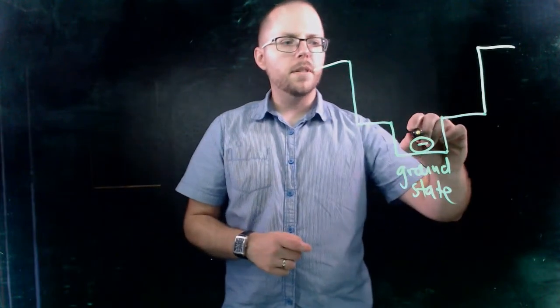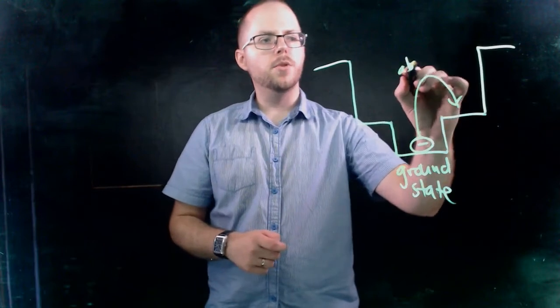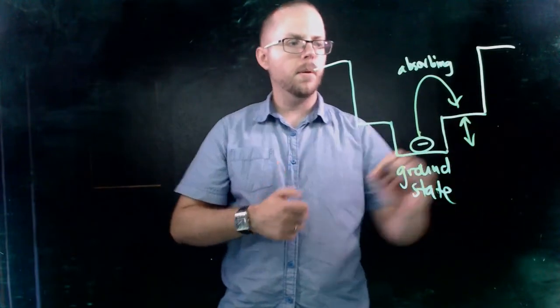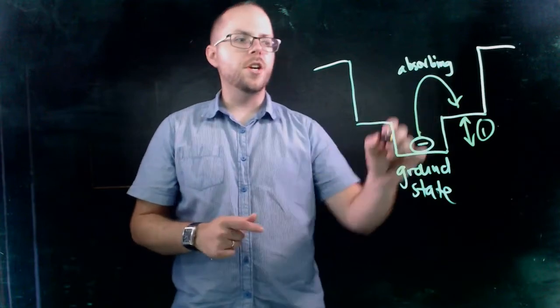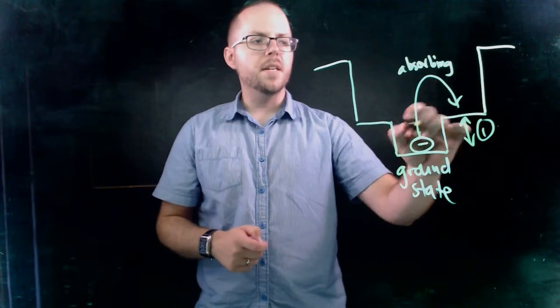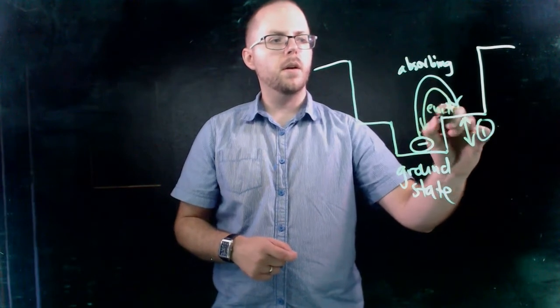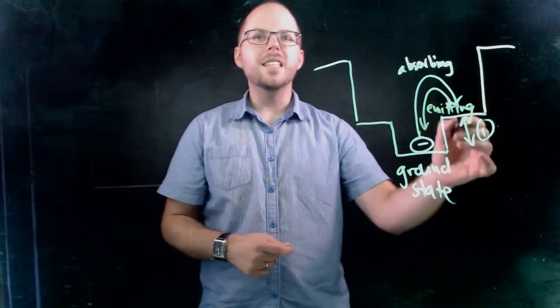Okay, so then what happens is that by absorbing energy, it can jump up a step. We have a particular distance of this step, and we're just going to call it number 1. So we're absorbing energy to jump up to step number 1, and then we can emit it back again, or release it again, to go back the other way. So emitting. I appreciate it's getting a little bit cramped. Bear with me.